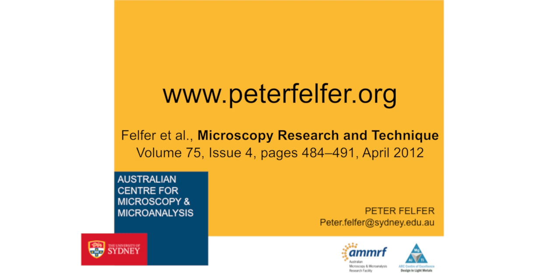I have to have a look into the FIB system. On our FIB system at least, I'm using the FIB patterning engine, which is a very good 16-bit patterning engine, and I like the interface and the abilities that it has very much. I just haven't saved as many or developed the patterns that I'm using on there as much, whereas the patterns that I'm using on the FEI Quanta, I've used on a variety of different FEI machines.